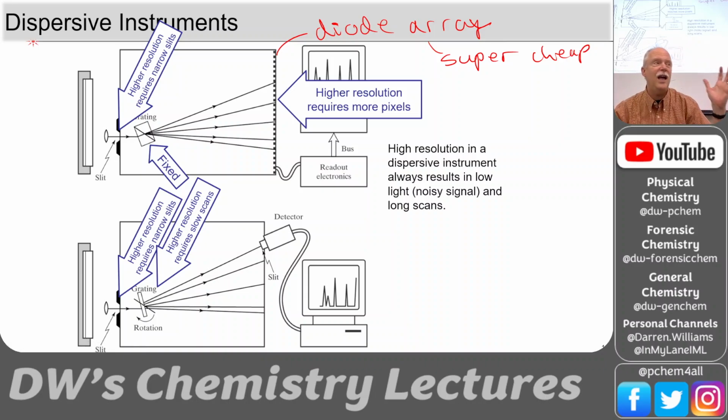You just get a more high resolution diode. But we've made digital cameras so ubiquitous that now we can just use one of those camera elements in a spectrometer. And so that's why these spectrometers have come down in cost. They even make some that are as small as a USB drive that will just stick right in your laptop. So, that's something we can look forward to in the future. We can take spectra, reflectance spectra right there at the crime scene. And that's kind of nice. In terms of chain of custody, it was straight from the scene. I mean, there's no ambiguity, right?